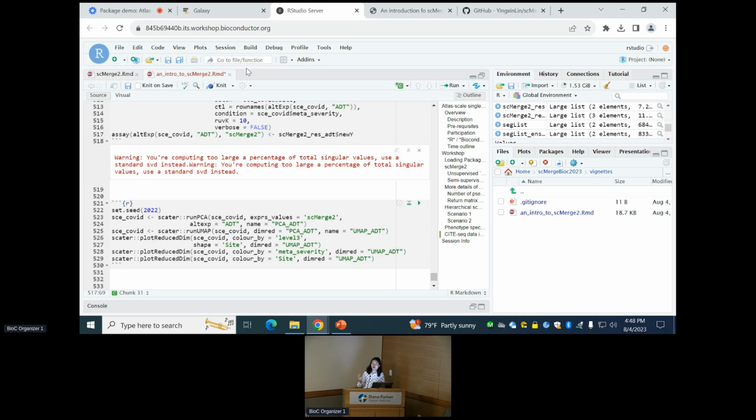So this is one thing to look at: whether the batches are corrected. And secondly, we want to see whether our cell types are overcorrected. One thing you can do is look visually at the UMAP plot to see whether they are merged with other cells, like totally becoming one big cluster now. This is another way to guarantee your biological signals are not overcorrected.